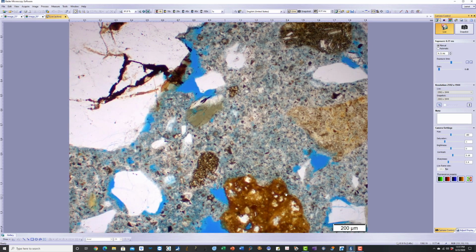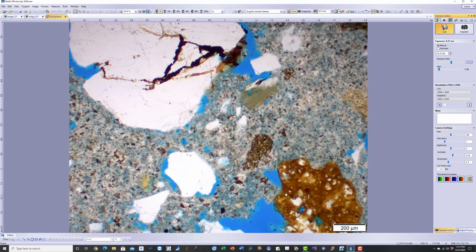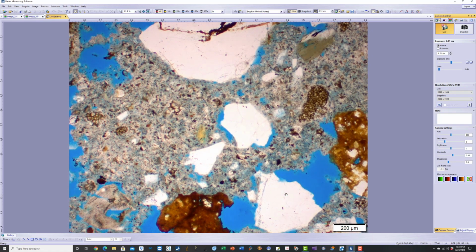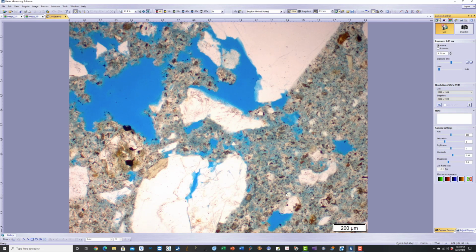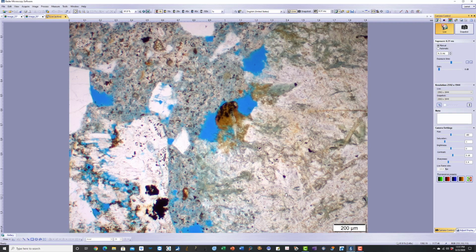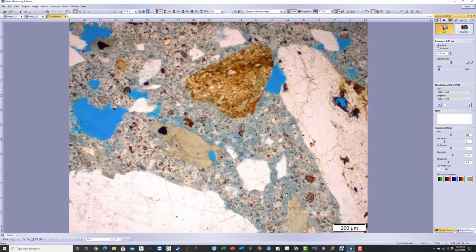The degree of cement hydration, the porosity of the paste, if the porosity varies from top to bottom, if there are any dense areas of the paste, porous areas of the paste, how deep the depth of variation of a particular feature. So a large amount of information can be obtained when we look at a thin section of concrete in a petrographic microscope. And the Basler microscopy camera is very helpful for a quick observation in a large area.